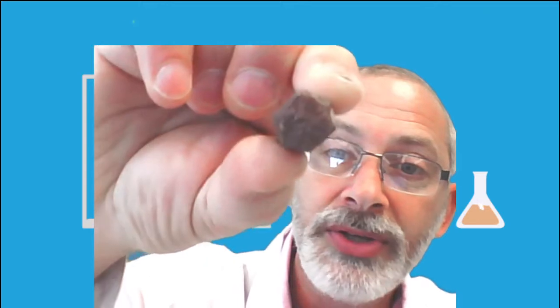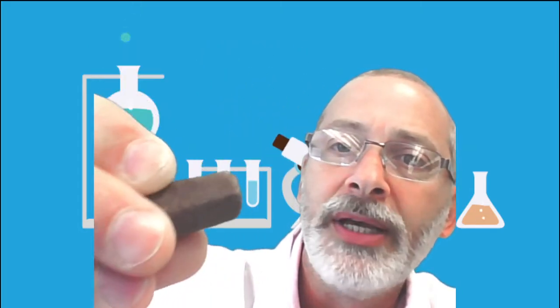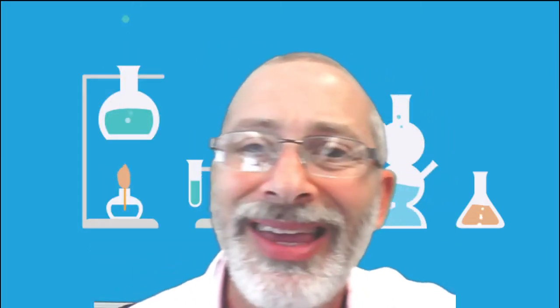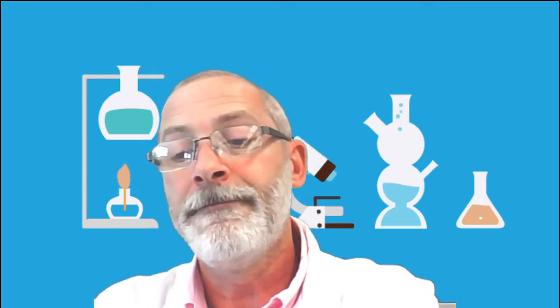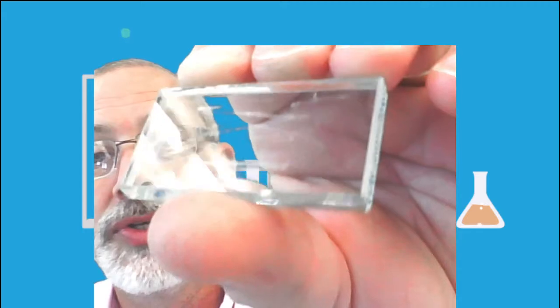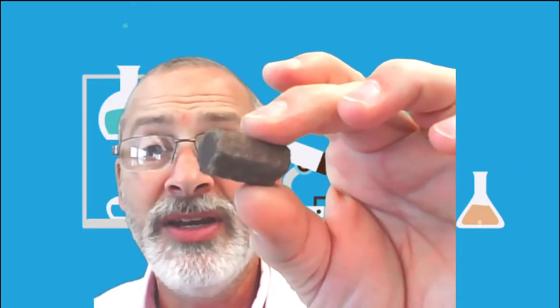Here's mineral number 7. Ooh, look at this. It also has a hexagonal. Oop, I gave it away. It's got a 6-sided crystal shape, but the hint for this one is to check its hardness. So if we use our hardness test kit, and I'm just going to move up to the glass here, it scratches the glass, folks. This mineral, number 7, is really hard.